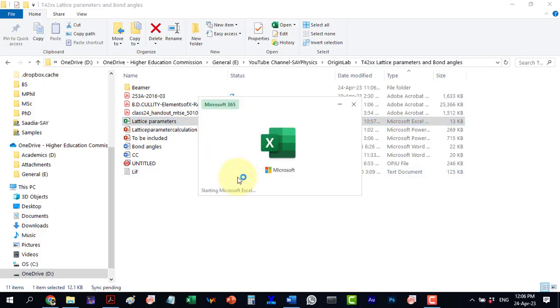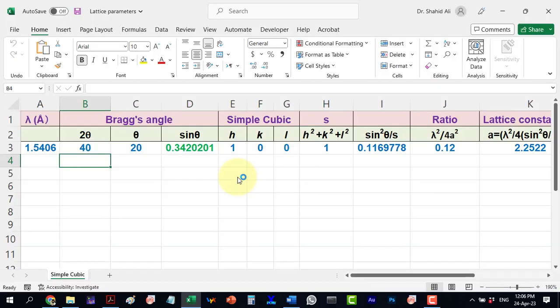As we have found the peaks positions, now go to the Excel template, in which we will do the calculations as discussed earlier in this tutorial. Please note that a link to this Excel calculation template will be provided for download in the video description. Here, this is the X-ray wavelength and here we will put the 2θ values as we found here.